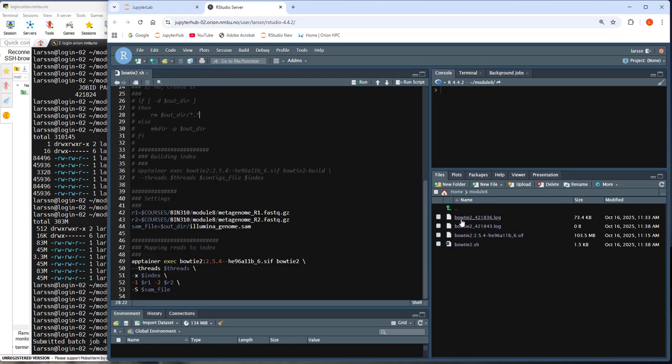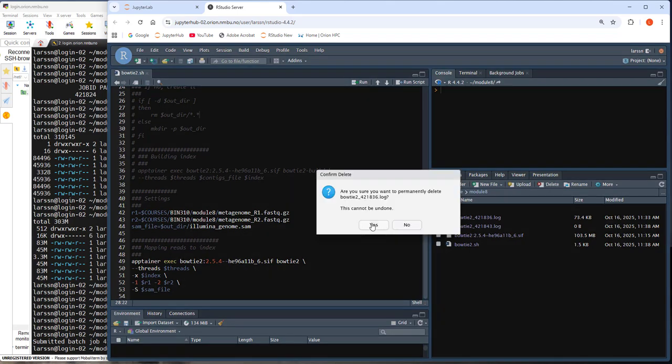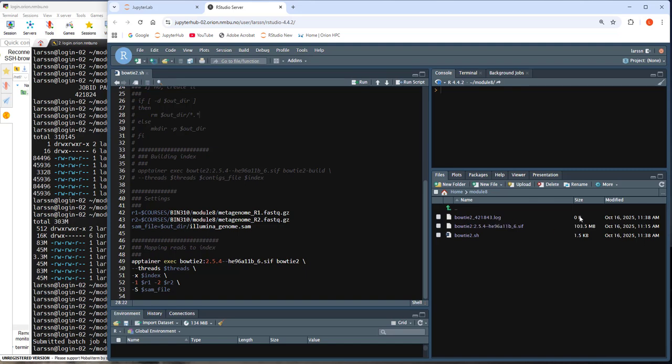So we don't expect to see any error message. And then we can actually delete this log file now. I do it here, like that. But this new log file is still empty, 0 bytes. It is not filled with anything. Some software will fill in something in the log file during their work or computations. But other software, like bowtie, will not send anything to the log file until it's finished. So this file will be empty until it's finished or crashes. Then something appears there.